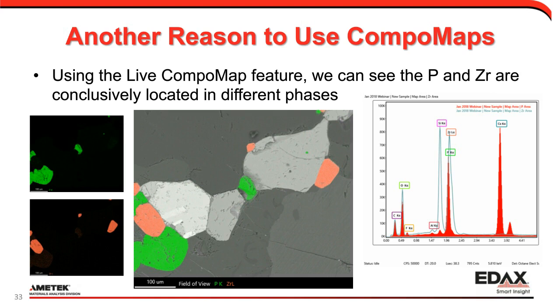The deconvolution routine is following along the whole time. And again, thinking about this, this one was a 512 map by 400, so about 200,000 pixels there, and it's doing all of this math on each pixel for the true display of our compound makeup.